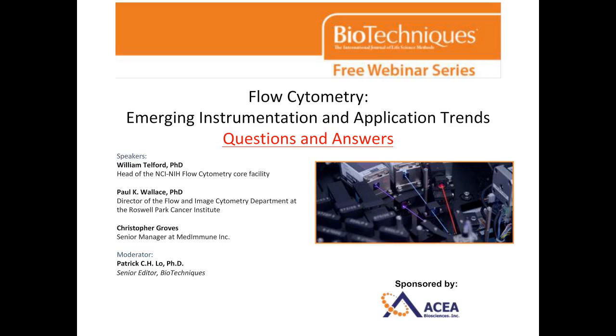I'm not absolutely 100% sure of this, but I do think that you shouldn't see an issue here any more than you would in, say, a more advanced BD system where you have 5 or 6 laser intercepts. You can analyze more than one cell simultaneously, and that significantly reduces the number of aborts.